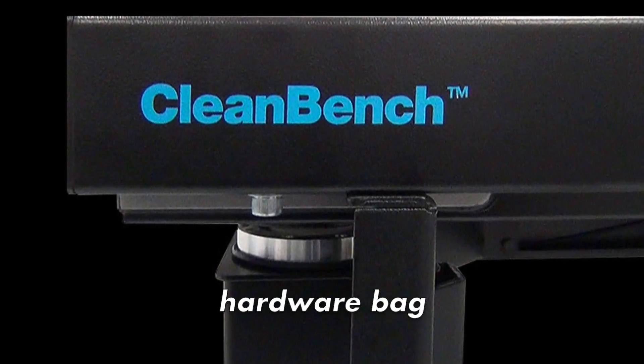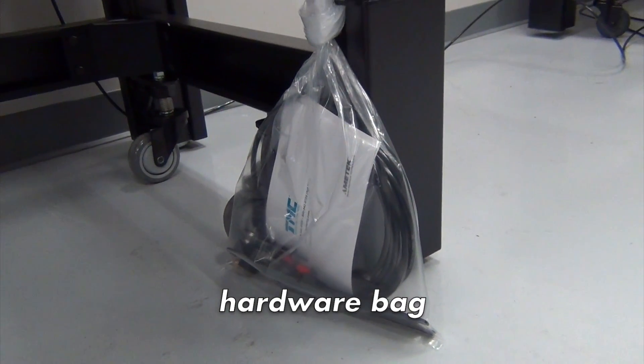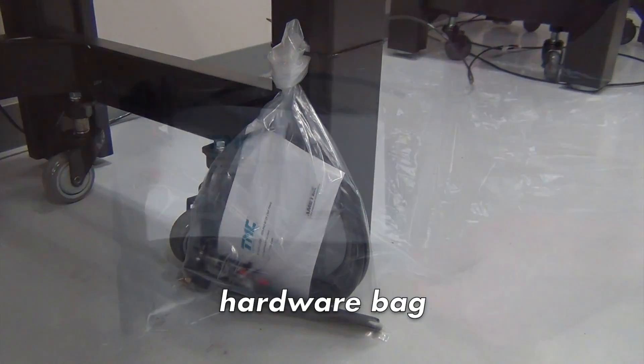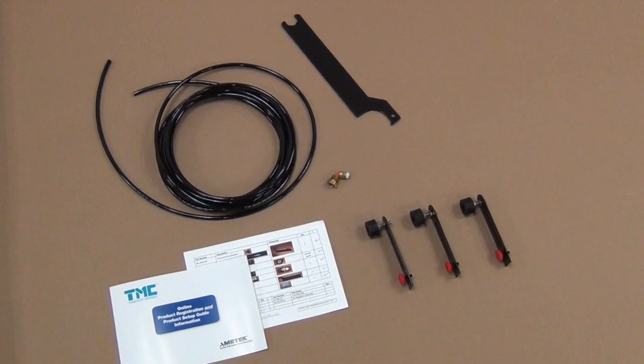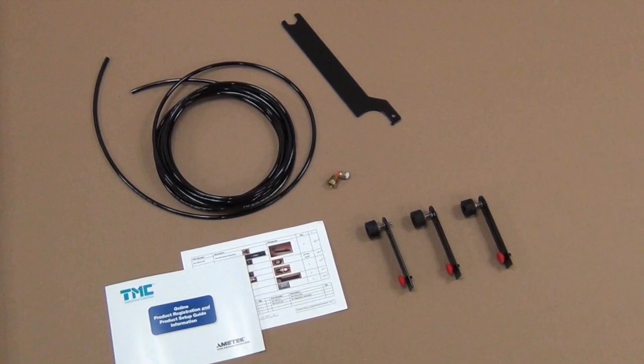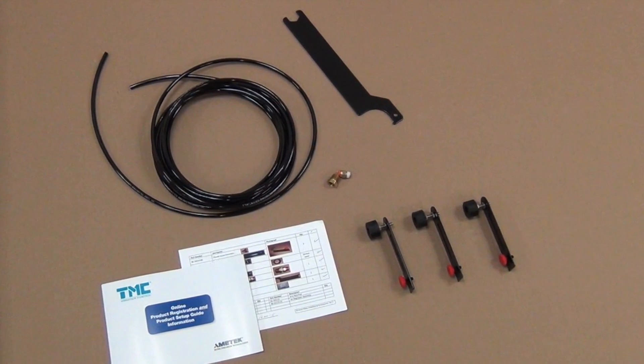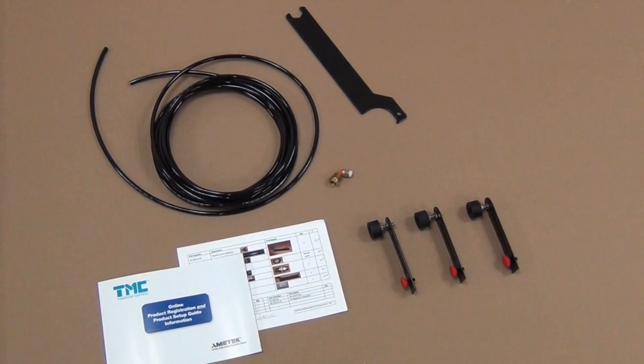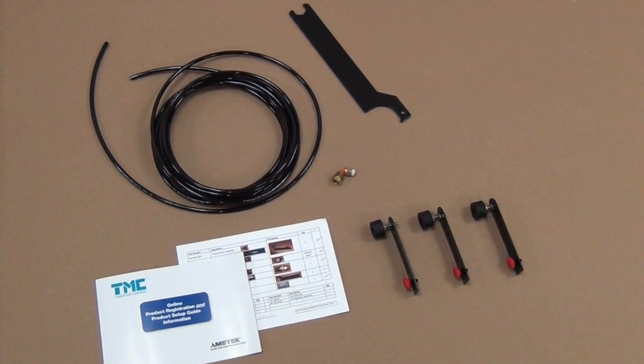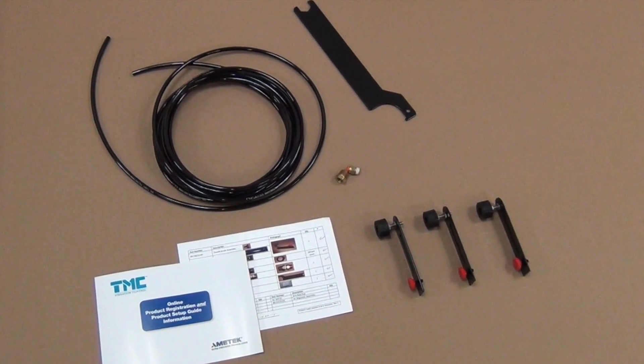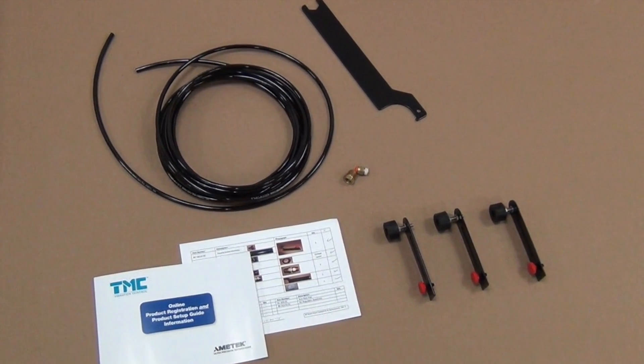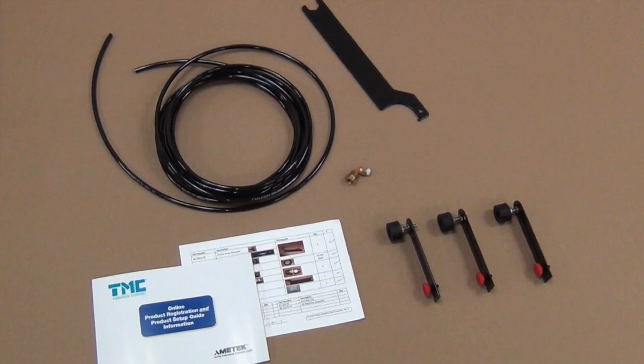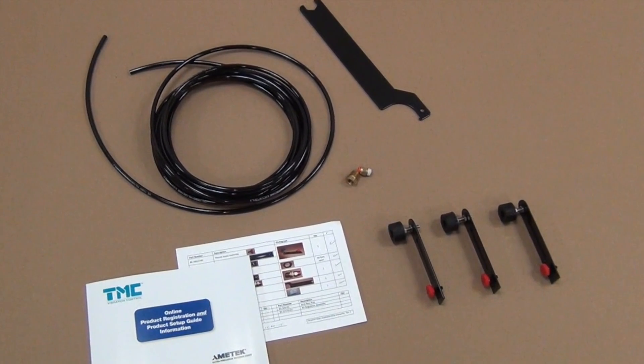In the hardware bag, you'll find online registration instructions, a hardware checklist, 20 feet of quarter inch tubing, a press lock fitting for the end of the tubing, and a reducing bushing which allows for the option of using either one-eighth inch NPT or one-quarter inch NPT male threads. It will be up to the end user's facility to provide 80 PSI of compressed air up to TMC tubing connections.